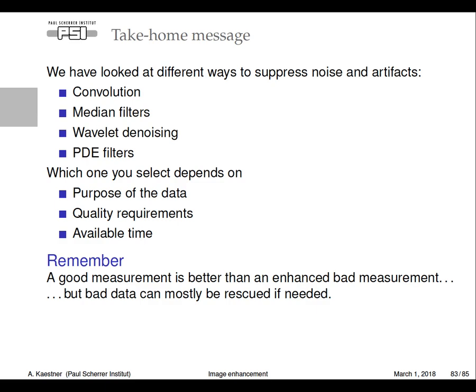And in principle, any good measurement, taking the time to do a good measurement, is better than applying a lot of filter techniques. But in the case that you have bad data, there are also techniques that can help you get along with that.